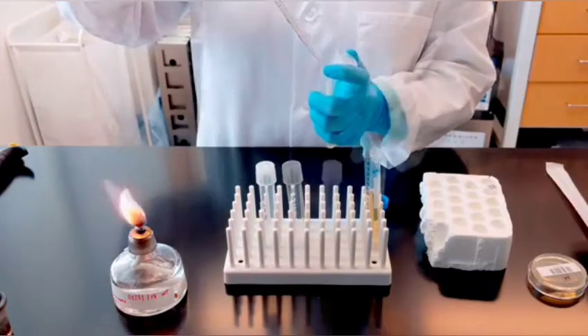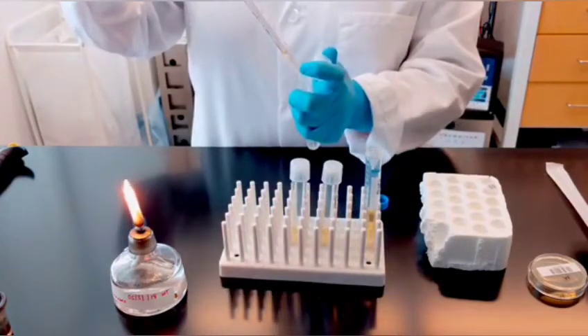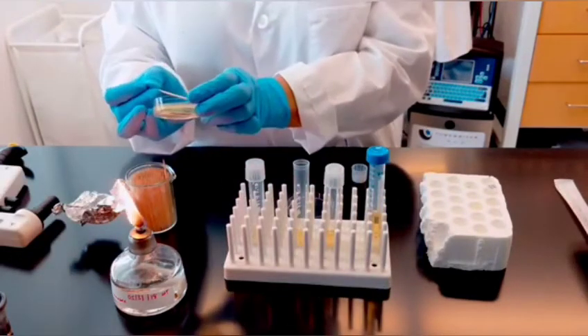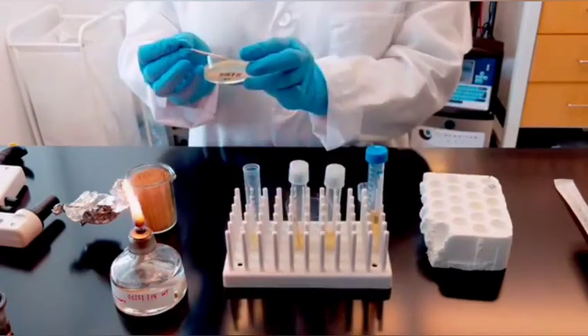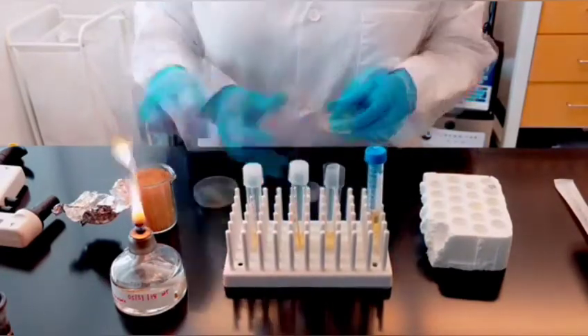Transfer 2 mL of the LB carbenicillin media into each culture tube using a serological pipette. Using a sterile toothpick, select a single colony from your LB agar plate. Remove the culture tube cap and drop the toothpick into the culture tube labeled with your plasmid name, then replace the cap. Make sure the toothpick does not touch the outside of the tube.